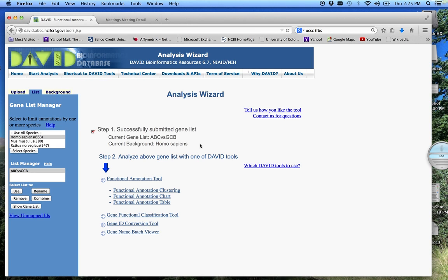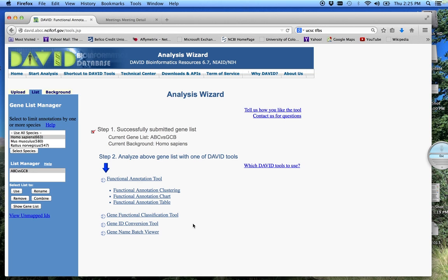Our gene list was looking at genes different between two different forms of B-cell lymphoma, one more aggressive than the other. Our second tutorial looked at how we explore this gene list at the gene level, and this covered the Gene Name Batch Viewer, ID Conversion Tool, and Functional Classification Tools.